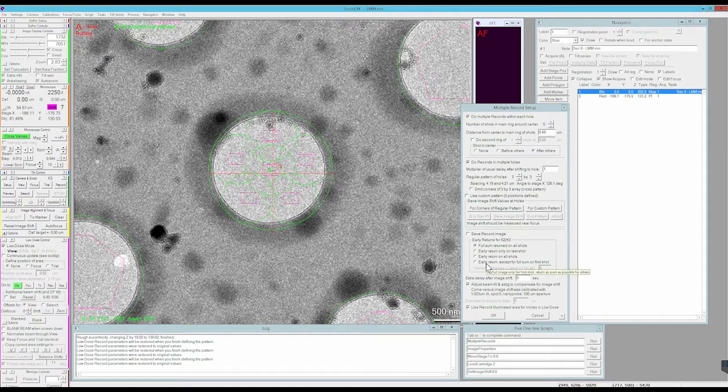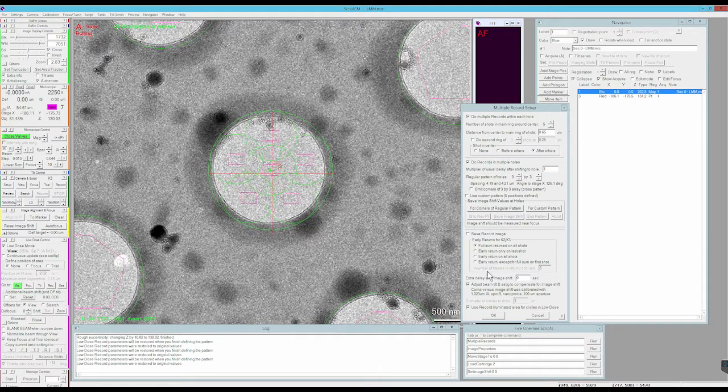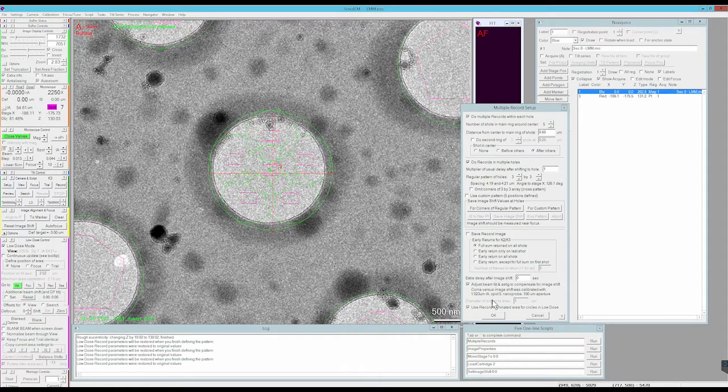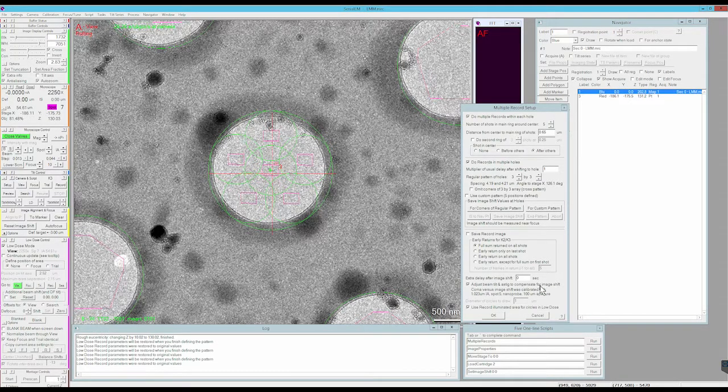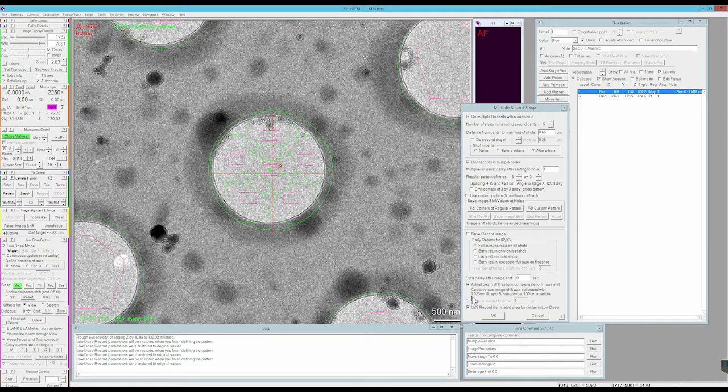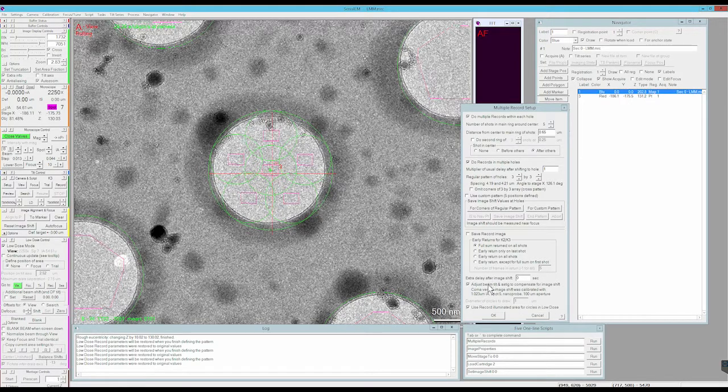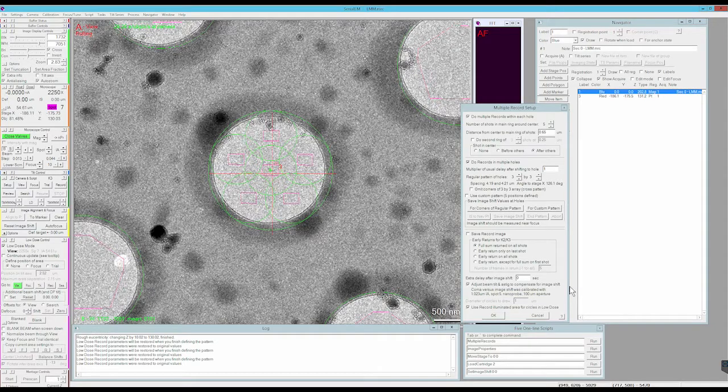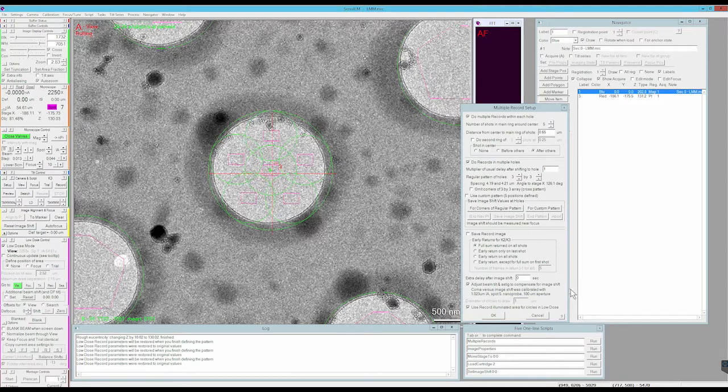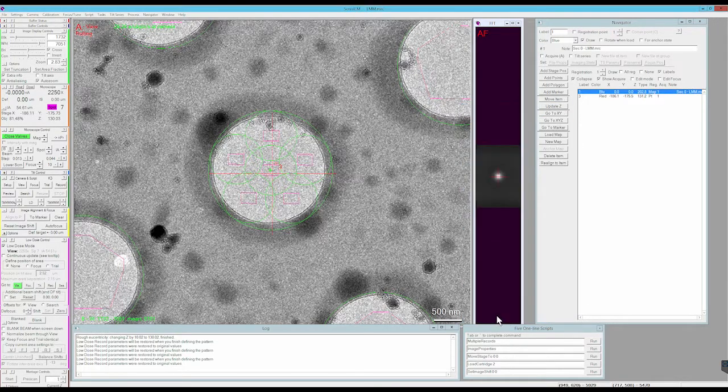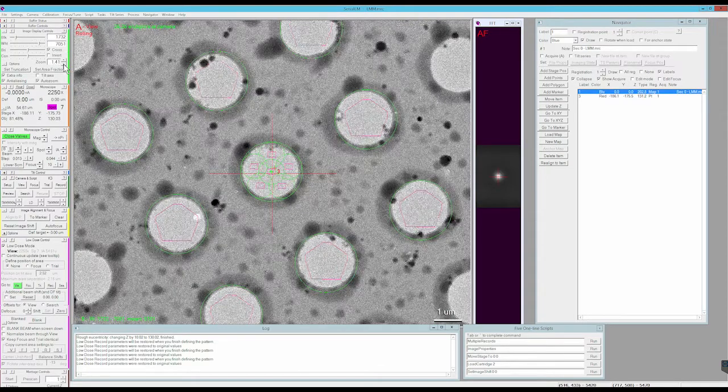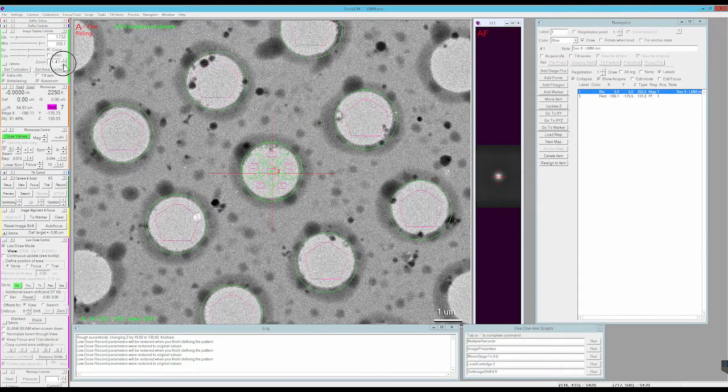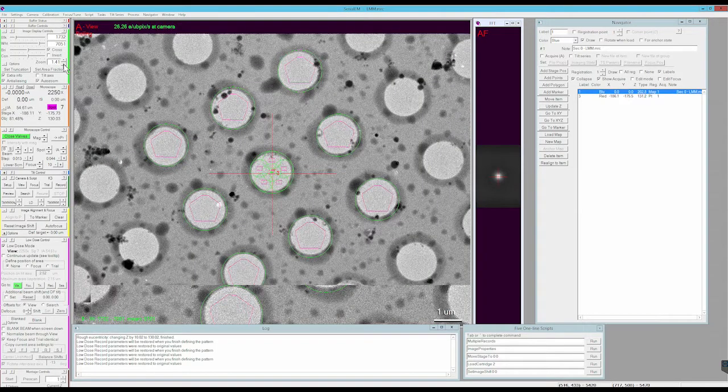The multi-shot setup is completed and you just want to make sure this adjust beam tilt and astigmatism compensation. You just want to make sure that beam tilt and astigmatism compensation are enabled and calibrated. Click okay, and there we go.